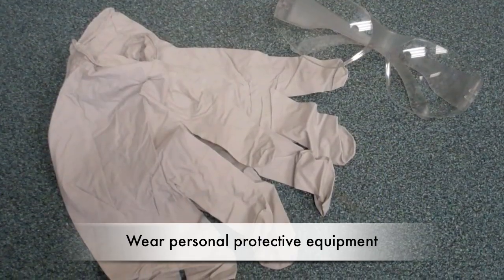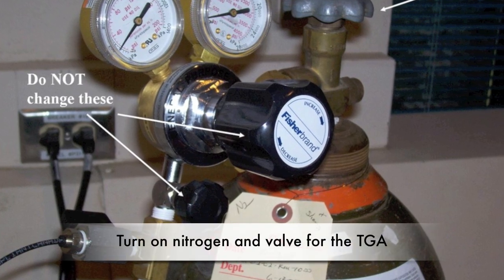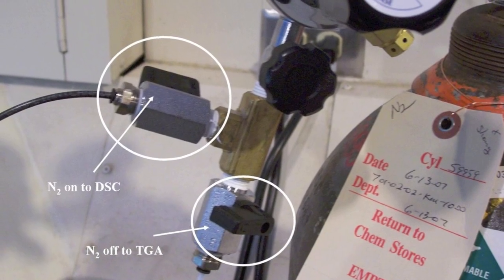Be sure to wear the proper personal protective equipment. Before starting, open the nitrogen gas valve and the TGA valve. Be careful if the DFC is already using the nitrogen.